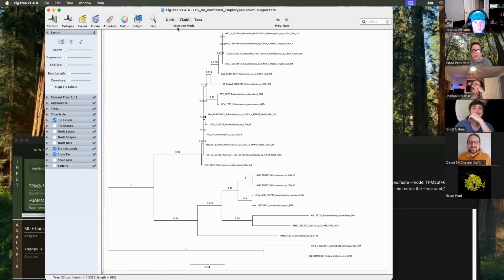What we really probably have here is that all of these ones are clustering together, but the algorithm doesn't know how to relate them to these other ones because they're not necessarily closer to the European sequences or closer to this other cluster. So it's given us an ugly topography here. But this basically tells you what we knew: things are messy here, and there's not a really obvious strong signal. There is clearly a cluster, and a cluster, but we don't know what to make of it.